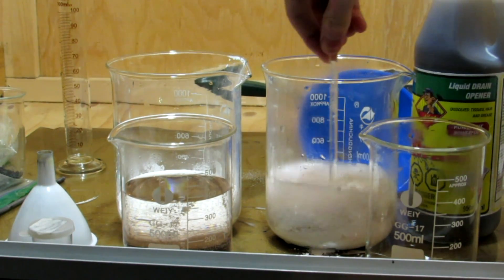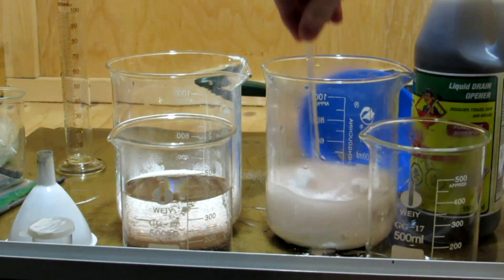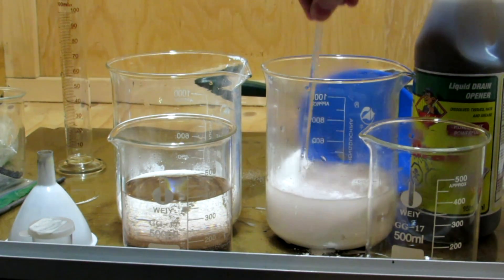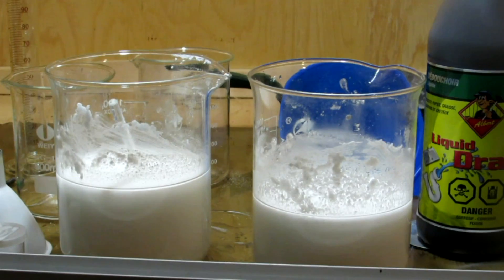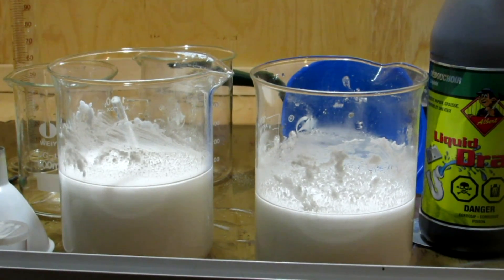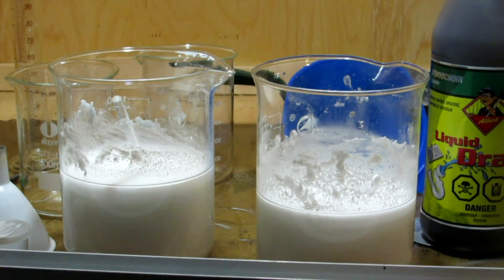In this reaction we're adding an excess of calcium phosphate, and this will just ensure that all of our sulfuric acid reacts so that the calcium sulfate will precipitate out and we can filter that off.